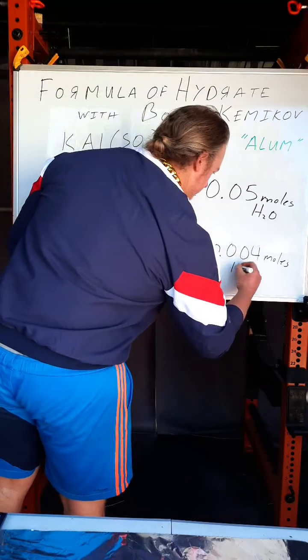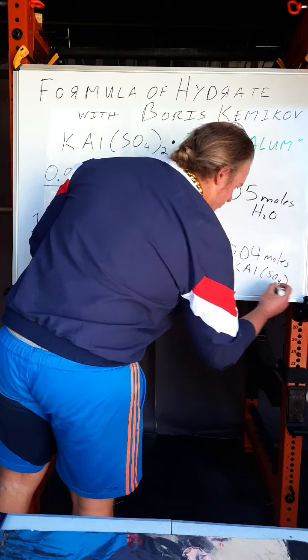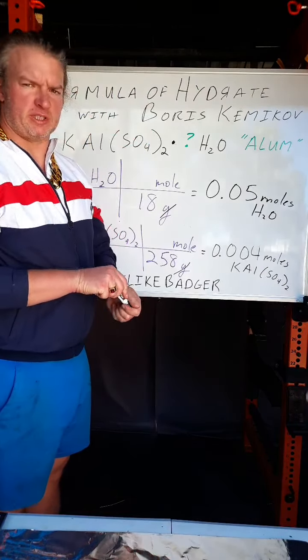So these are the moles of potassium aluminum sulfate, dry or anhydrous.